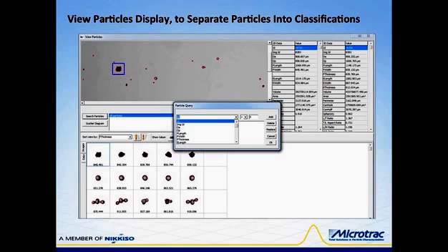When a classification is chosen, the image file and the scatter diagram display and list data for only those particles in the classification. The sample shown is a mixture of sand, good glass beads, and bad or misshapen glass beads mentioned briefly earlier. And many other types of classifications and filters can be set up for other types of materials.